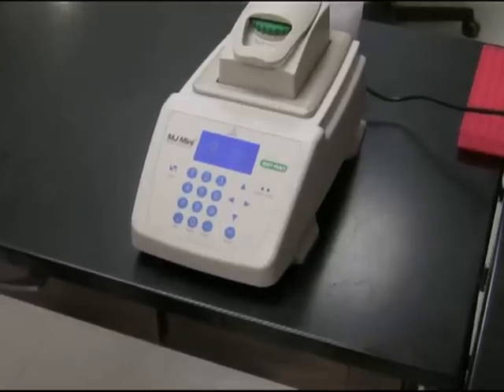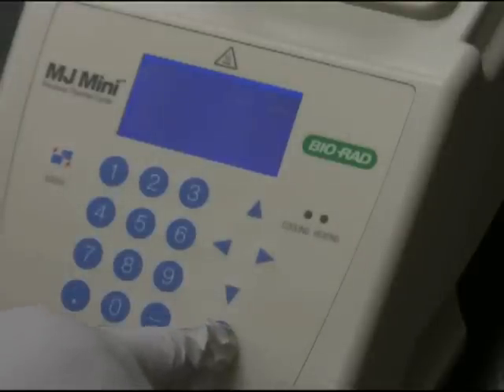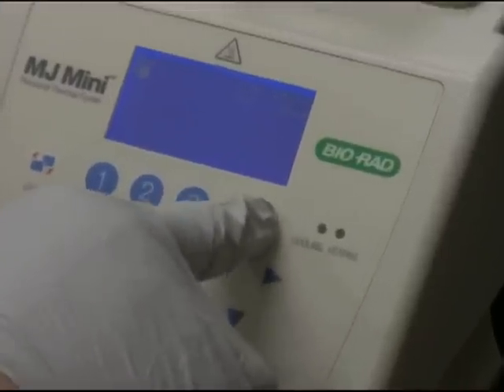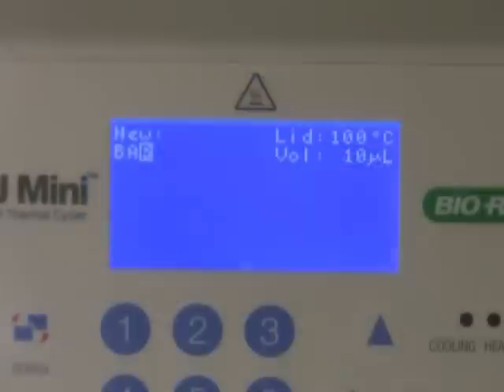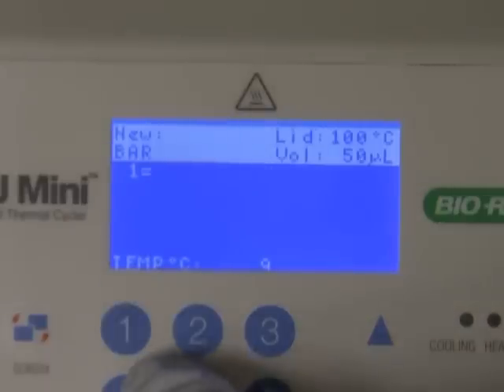Let's start the PCR step with programming the thermal cycler. I'm going to enter a new program. The program name, as you might guess, is bar. The reaction volume is 50 microliters. Step 1 is 94 degrees Celsius for 2 minutes. During this step, we are going to completely denature our template.